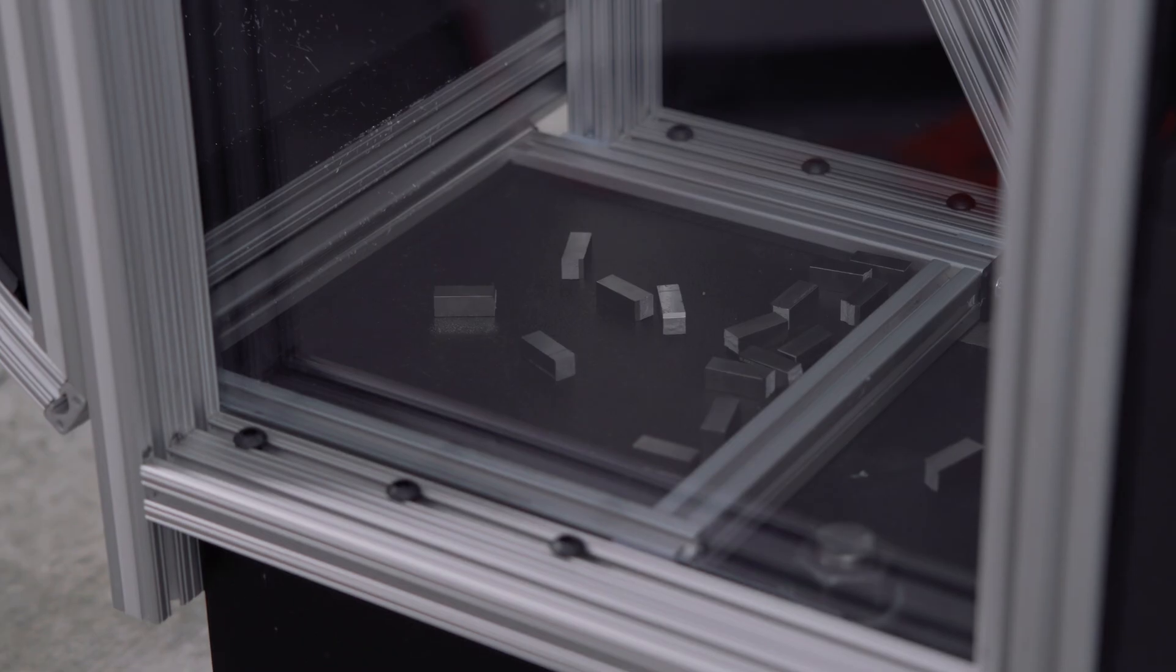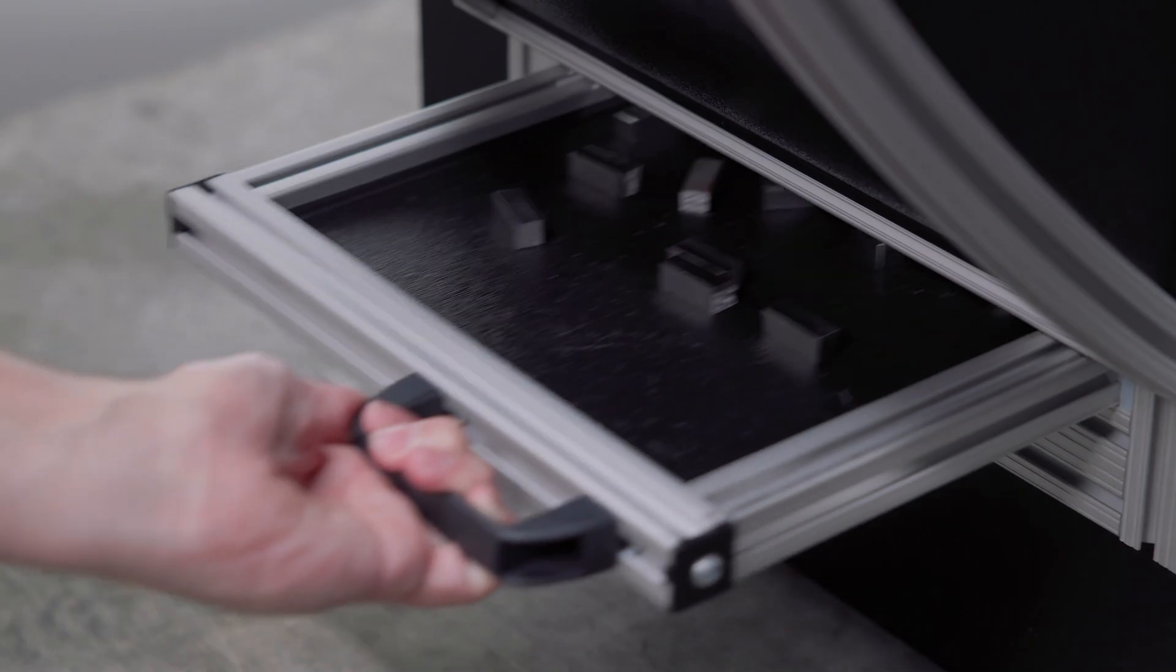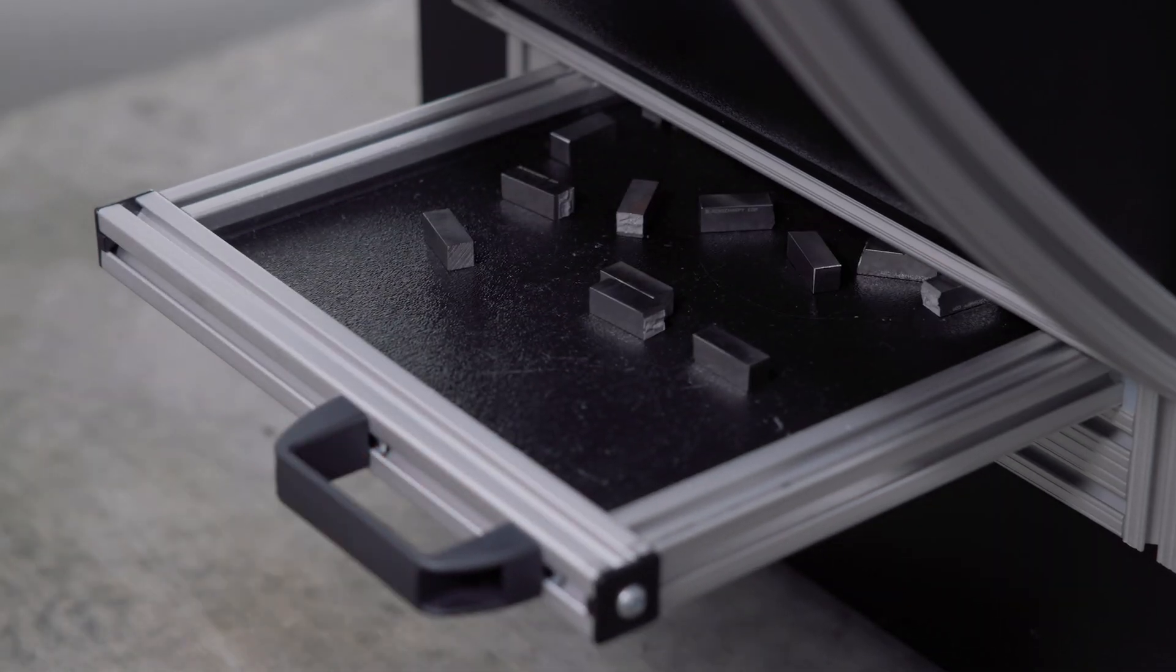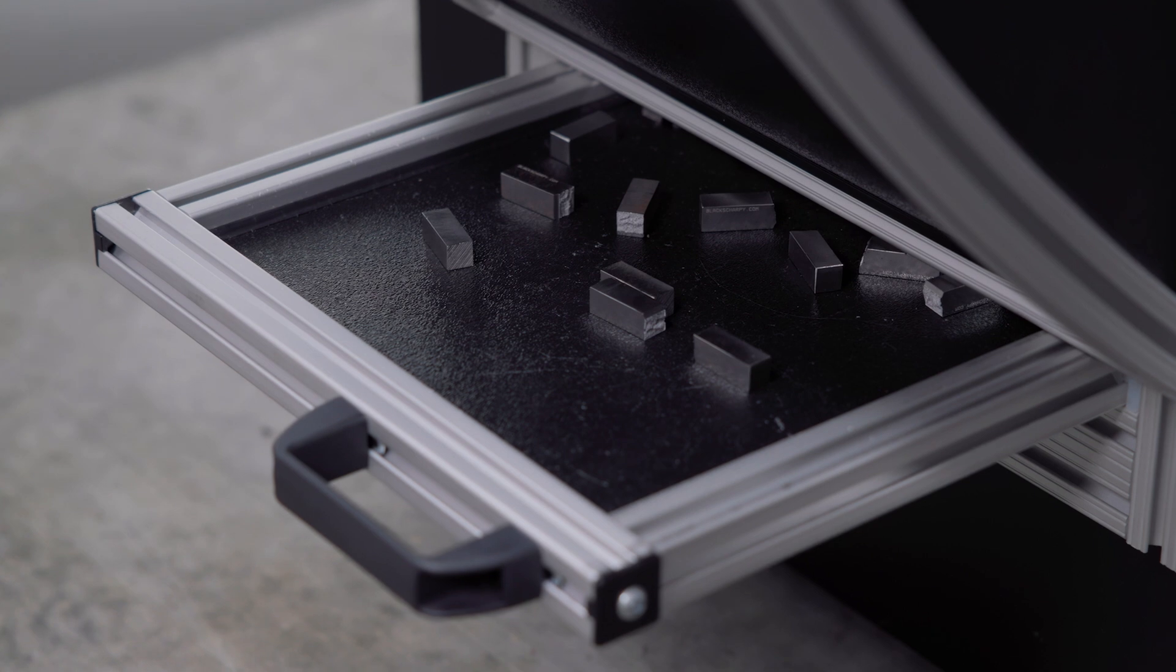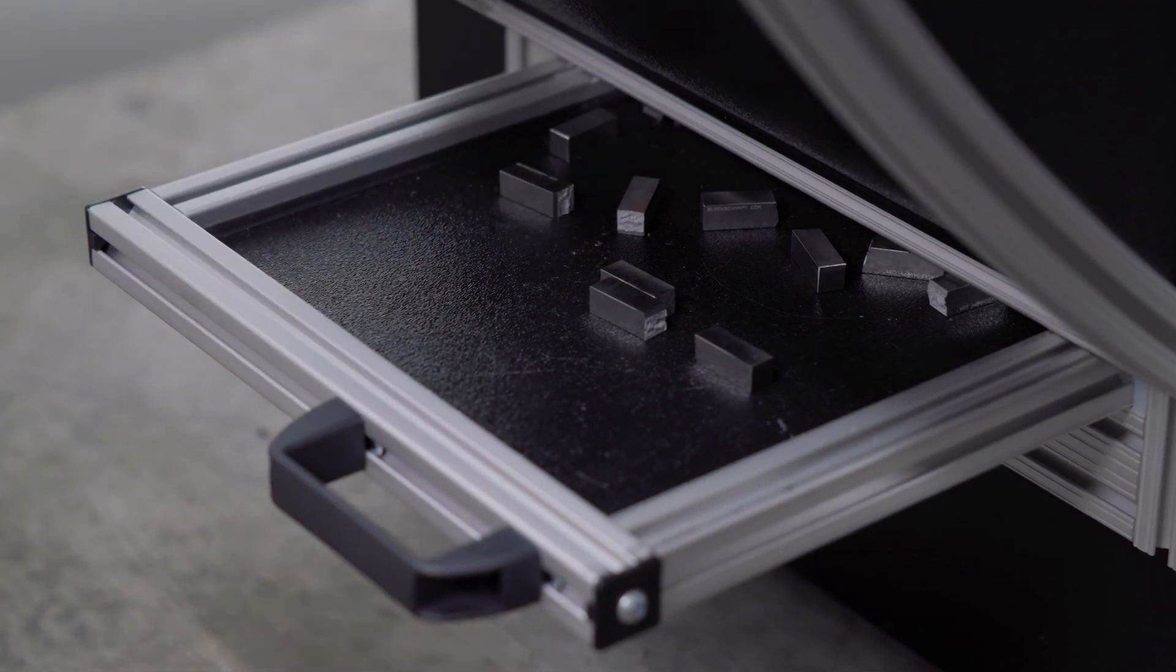And one last item I want to point out on the frame is that when you're running a lot of tests and specimens build up inside the frame, you can use this drawer on the side here to clear out tested specimens without having to reach into the test space.